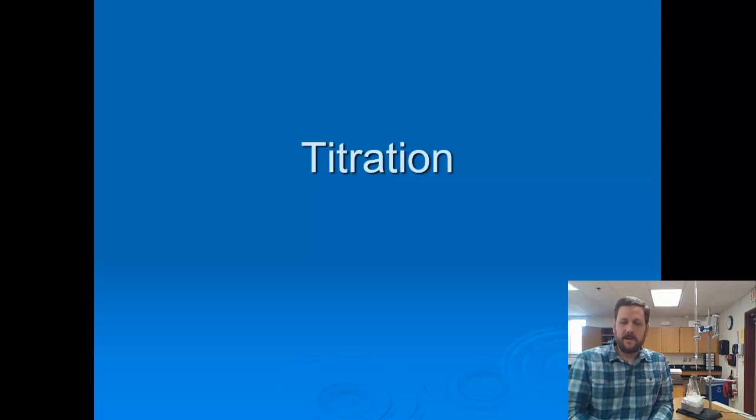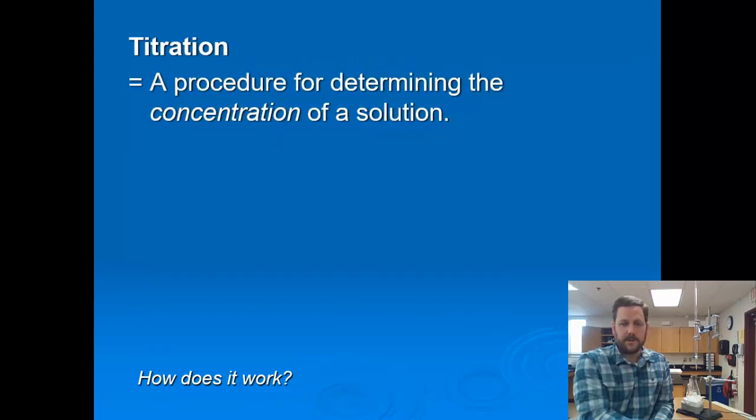Hi everyone, we're going to learn about titration in this video, which is an important lab technique. It's basic to any introductory chemistry curriculum. So how does it work? And what is the objective? Well, titration's objective is to determine the concentration of a solution.